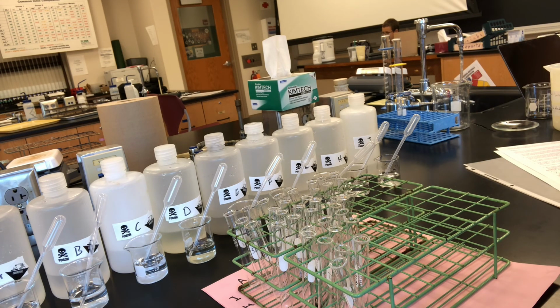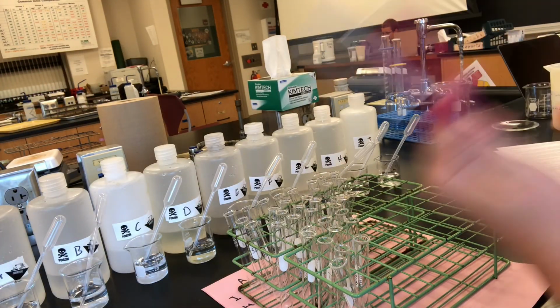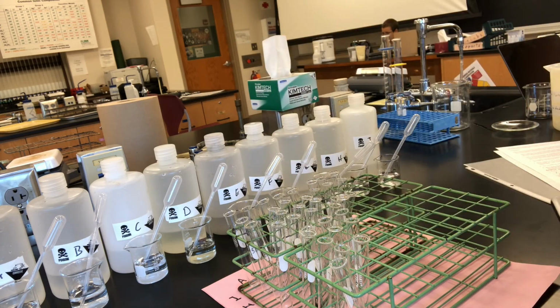So in front of us, A through I are all clear and colorless solutions. Now we're going to mix them together and see which ones form a precipitate, and that will give us hints, like a nice little puzzle, to figuring out what our unknowns are from the list at the front, where it says materials needed per pair of students. You're going to identify these 9 unknowns.